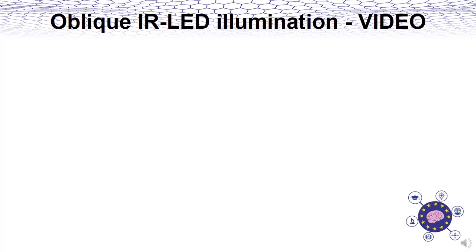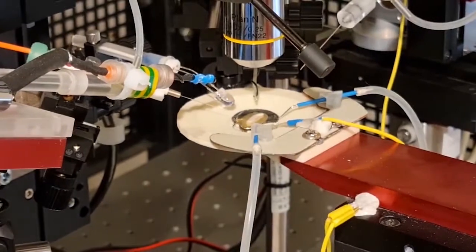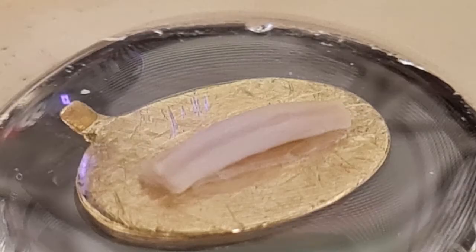The spinal cord block glued to the metal plate is then transported into the recording chamber, and the setting up of the oblique illumination begins. A regular imaging session will be shown in the following video clip. Adjust the position of the preparation with the forceps, and please make sure that when you're gluing your prep, the recording surface faces upwards.